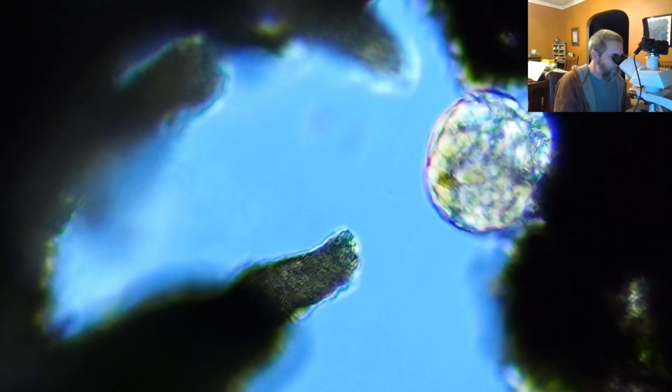There's two of them, it looks like. There's another one on the back side of that chunk of debris. They're kind of fighting for space. Yep. So also, oh, maybe the one in the background is actually something else. No, that's definitely a rotifer.